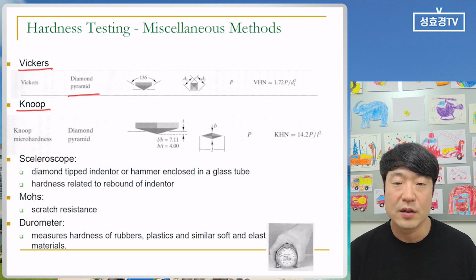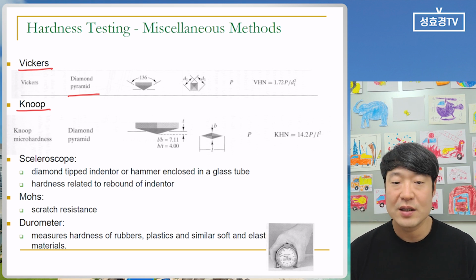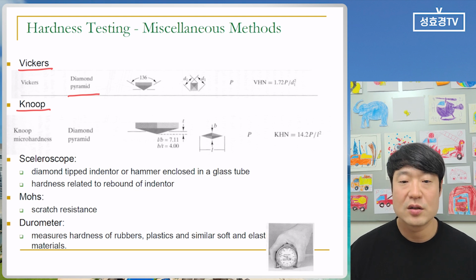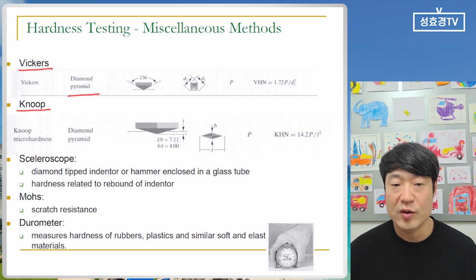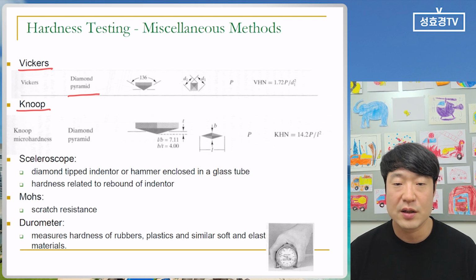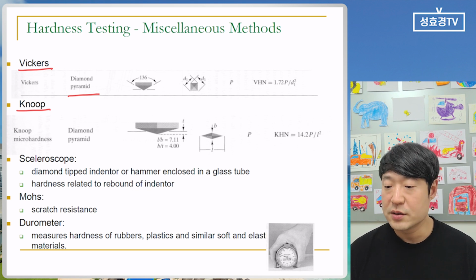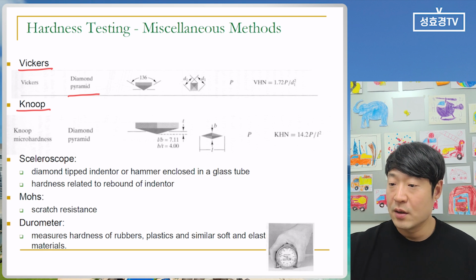can use nails and just scratch it like that. But that is not the scientific way. Nowadays the scratch test is very good for understanding hardness, because if you only push and penetrate it, you cannot get enough data. So scratching is a very good method to understand hardness.